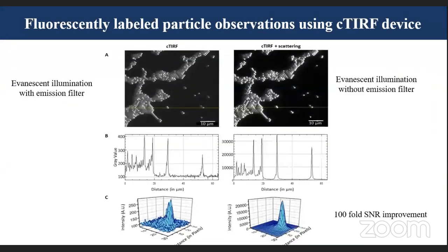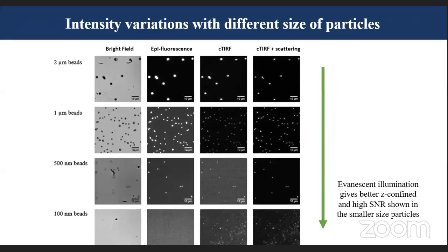So these were a few observations which I made and quantified, and published in a journal paper, and it was widely accepted. You can see how, if we keep on reducing the size of the fluorescence beads which we were using earlier, the beads were getting better illuminated as the size was getting reduced. I'll tell you the reason why it was getting better illuminated and why it was not better illuminated when the size was beyond a certain size.